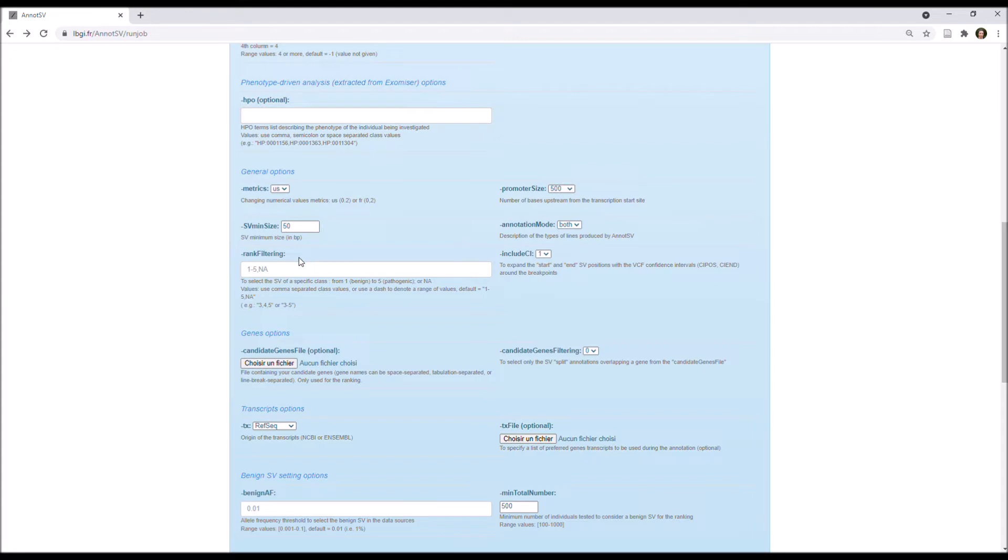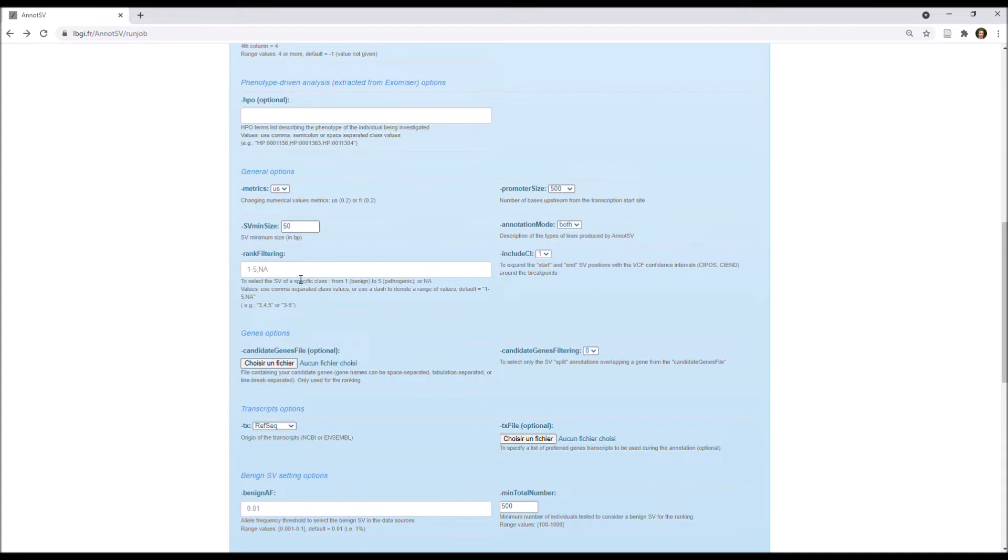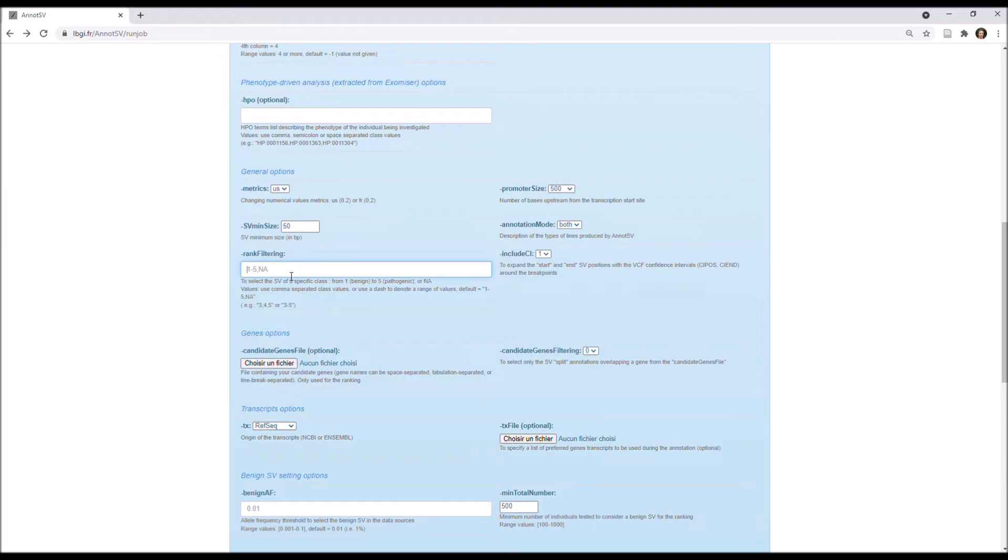Next, you have the possibility to select the SV of a specific class, from 1, benign, to 5, pathogenic, or also NA for not available ranking. And indeed, the ranking cannot be processed if the SV type is not given in input, and moreover, currently, the ranking is only available for gain or loss. So, for example, with this option, you can decide to report in the output only the pathogenic, likely pathogenic, and variant of unknown significance. So, you can write that like 3 to 5.